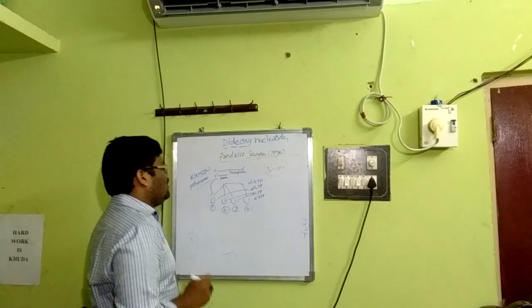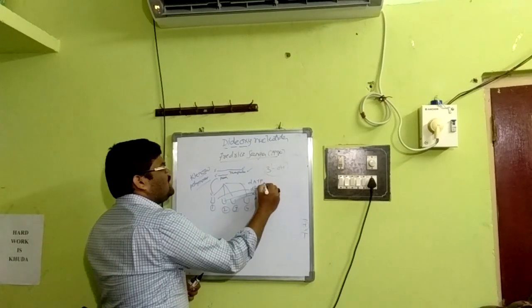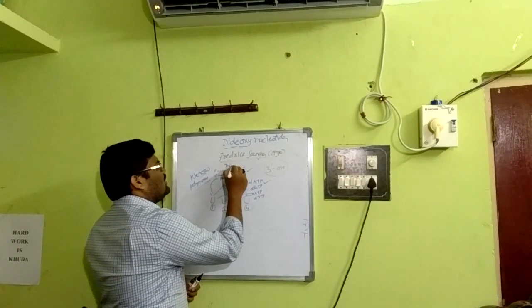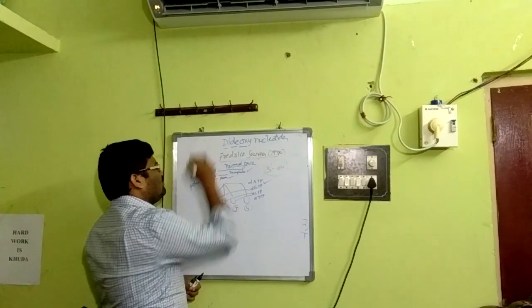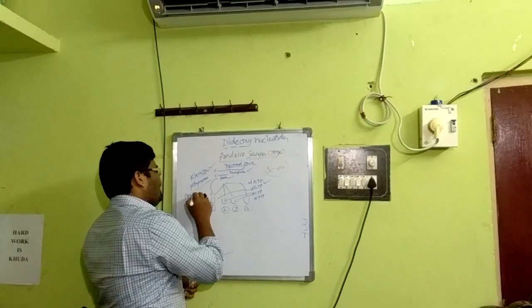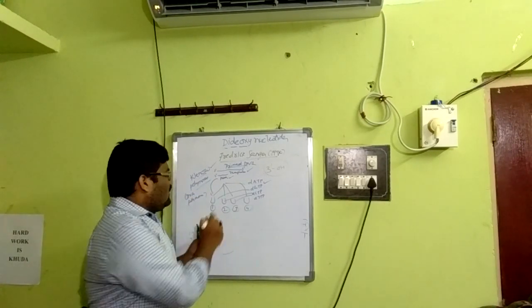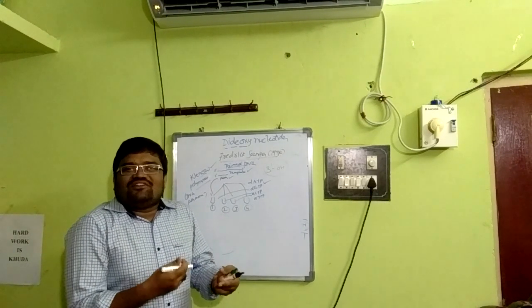That means we have added the template, the raw materials, the primer DNA, and then the DNA polymerase. In all four tubes, 1, 2, 3 and 4, this is enough for the synthesis of DNA.